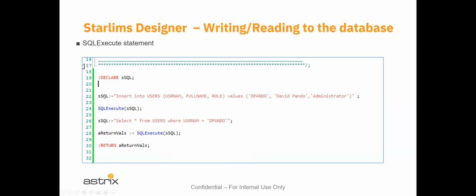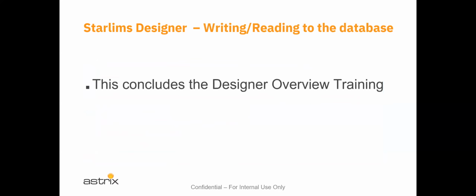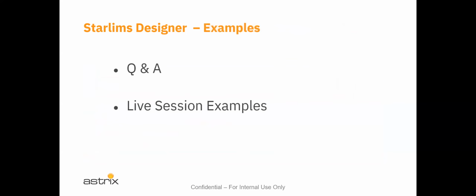So we're doing an inline reassignment here. We're using s equal to insert. We're executing the statement, and then we're changing the value of the s SQL statement for the select. So this is an all-in-one, reading and writing from the database. So that actually concludes the designer overview training, the overview component of it. And we can do Q&A here, and we can do live session examples.